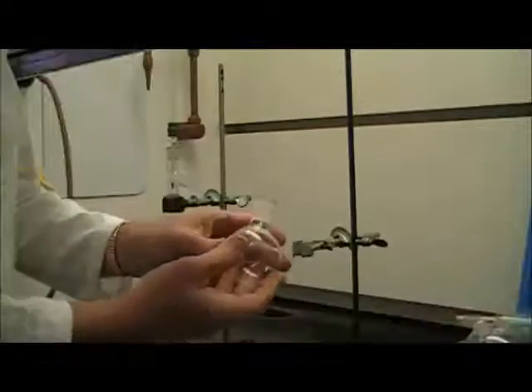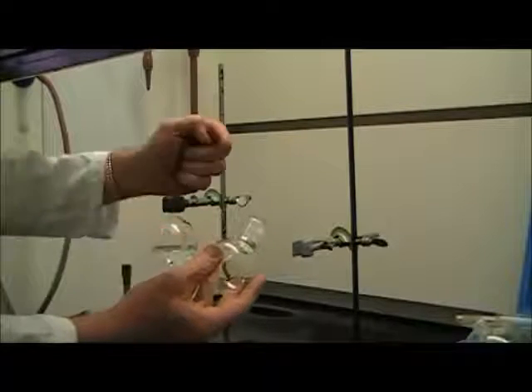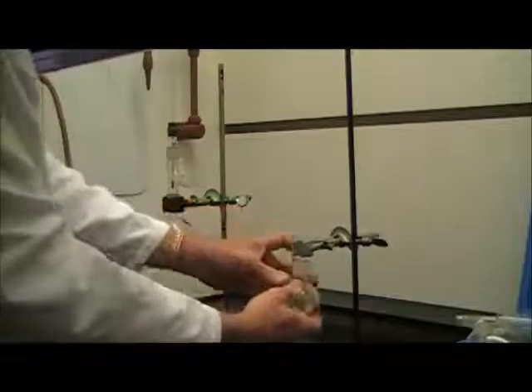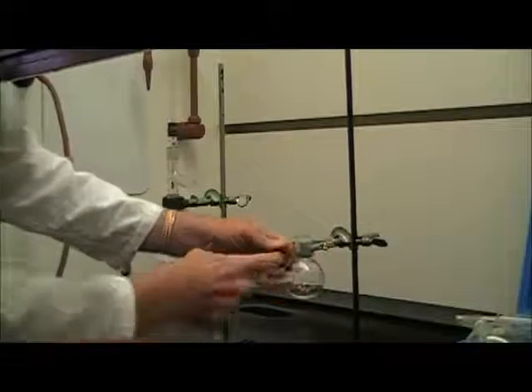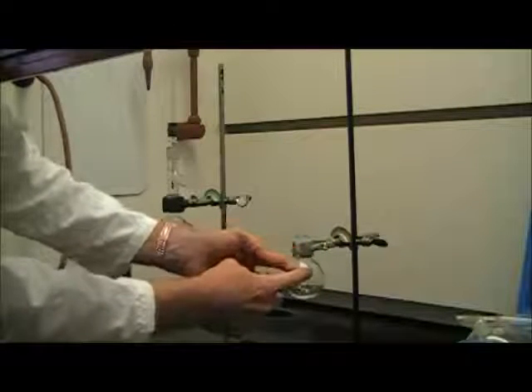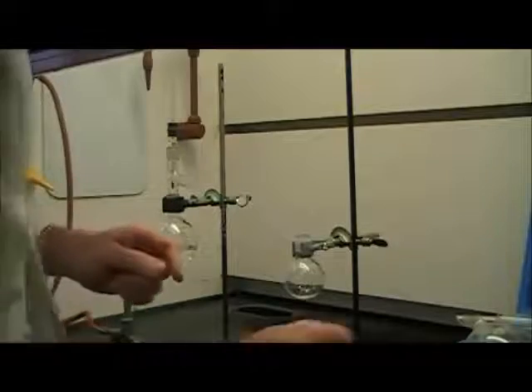So instead, let's go ahead and attach the smaller round-bottom flask. This is what we're going to be collecting into. I'm going to attach it to the second ring stand, and notice that again, clamping it at the neck of the round-bottom flask, just as I did on this round-bottom flask.